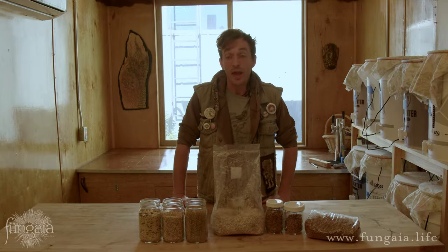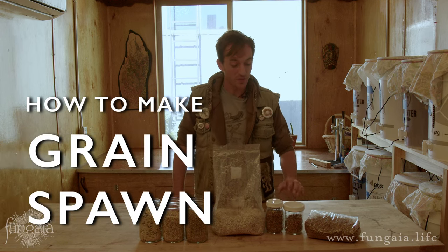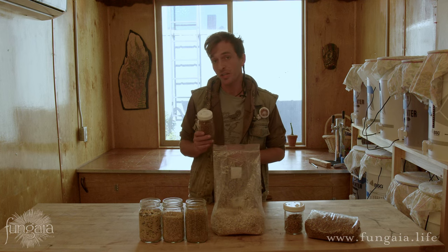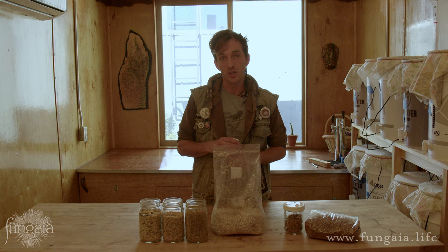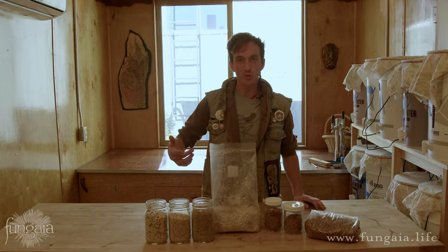Hi folks, thanks so much for joining me today. In this video I'd like to show you how to prepare grain spawn for mushroom cultivation. This is a very important part of the mushroom cultivation process and it's pretty straightforward as long as you follow a couple of very helpful tips, tricks, and techniques.